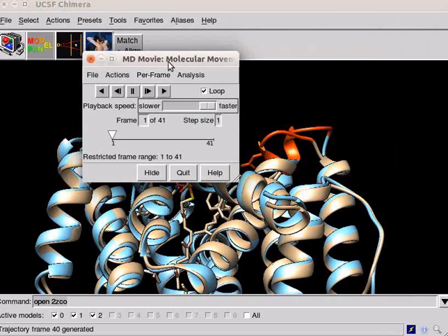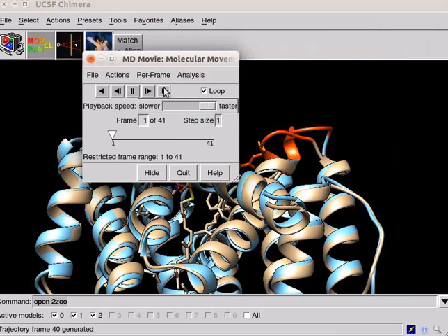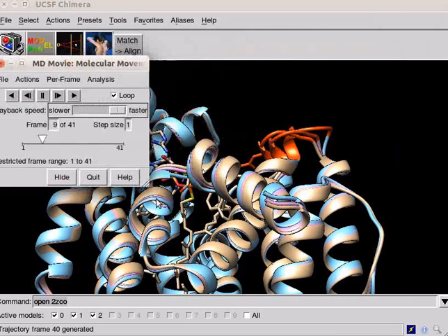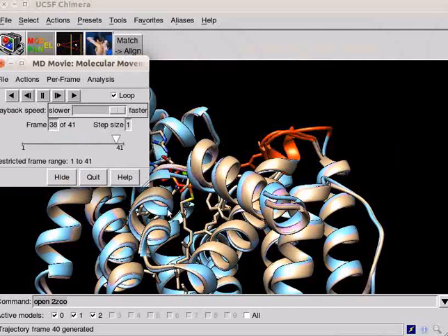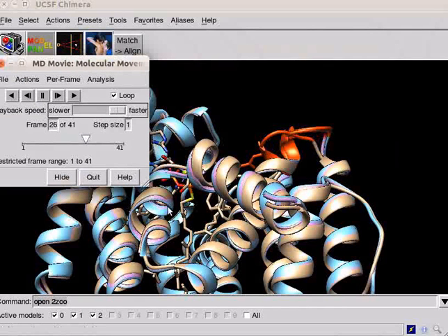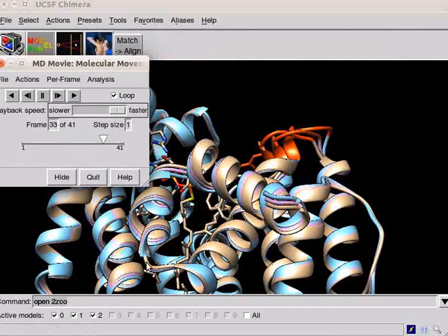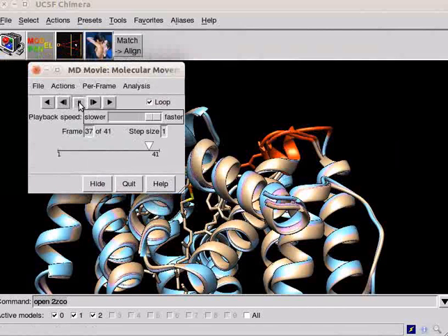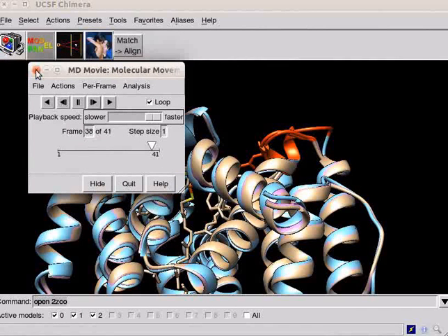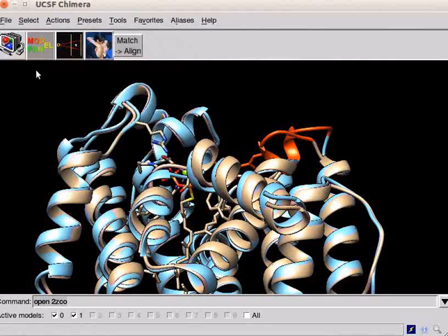The dialog box has buttons to play or pause the movie. Click on the arrow button to play. Observe the panel. The morphing of conformation is being played as a movie. Pause the movie and close the MD movie dialog box.